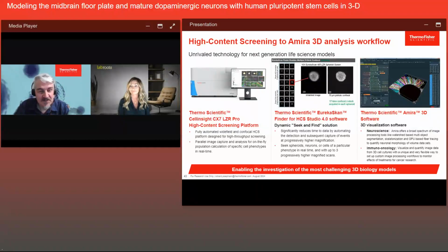Well, we haven't done too much experimenting with it. As I said, we haven't been able to use the dilute gel tricks in a horizontally shaking platform because it brings the spheroids together and aggregates them. But we are looking into whether a bioreactor, especially a horizontal wheel bioreactor, might be a good way to scale up because it doesn't have that dead spot that a rotating plate does. So it's keeping the spheroids in constant motion, and that should keep them from aggregating, but don't take my word for it.